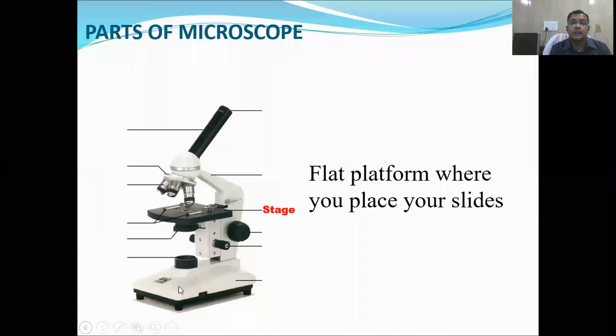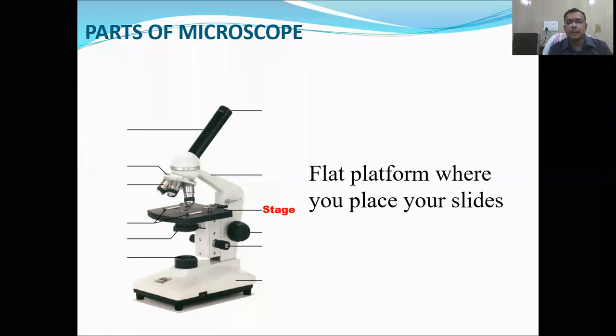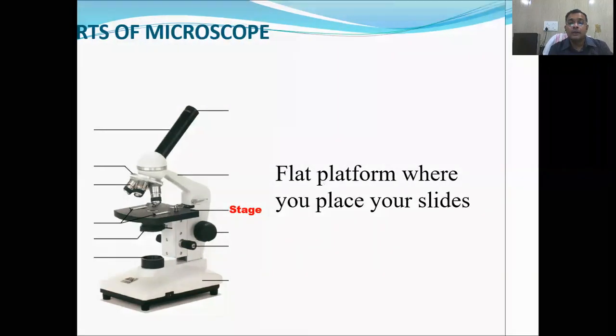And stage clips. Stage clips are the small clips with which we can hold our slides. They are known as stage clips.